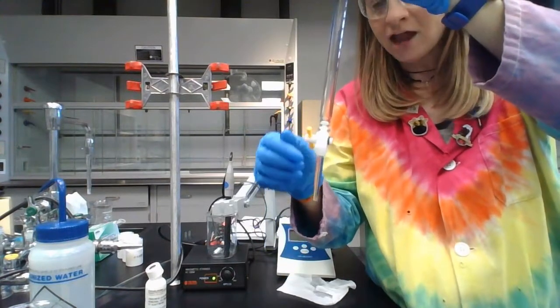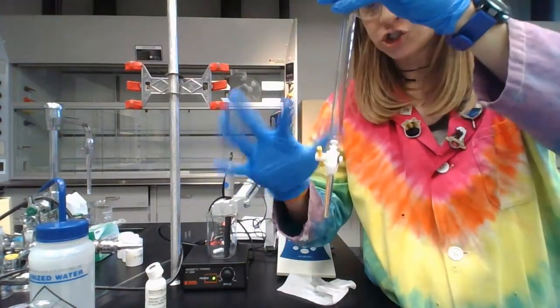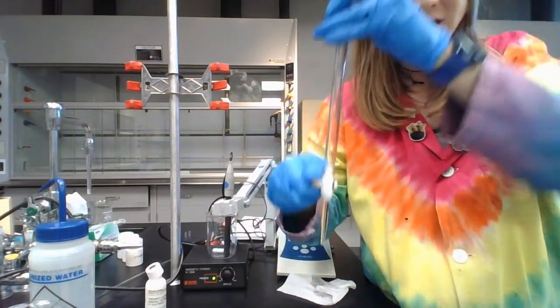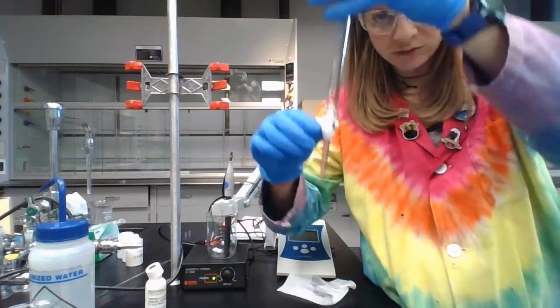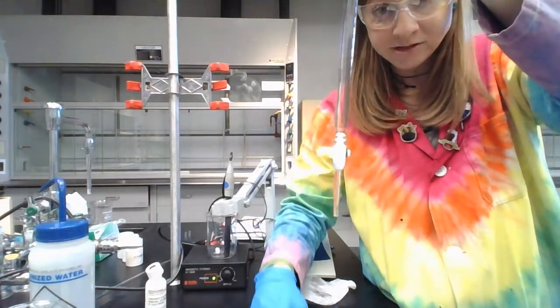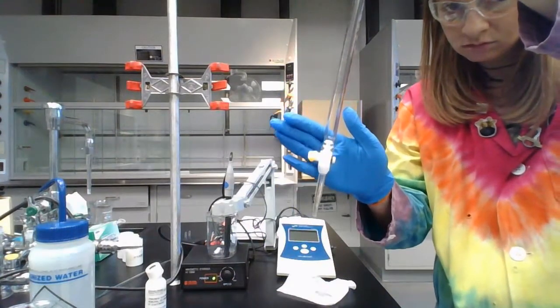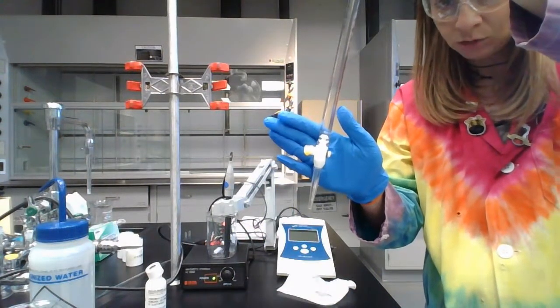For me, I always screw this up. When I go to shut off the burette, even though I've done it a million times, I always open it up really wide. So I'm trying to stop the burette, but what I do is I open it. So instead, when I need to add small amounts of liquid, that's not going to work because I need to use my hand.